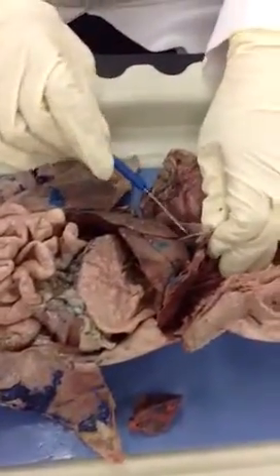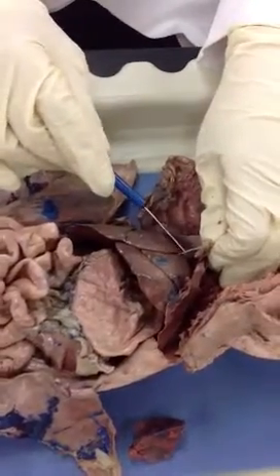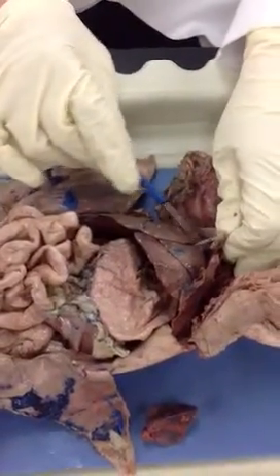Here we encounter a ligament. Which is the name of this ligament, please? Round ligament? No. Falciform ligament. Yes.